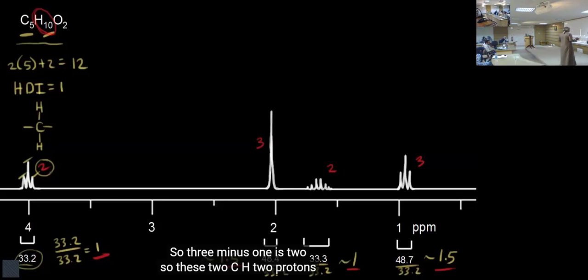Okay, I want to ask, I don't understand the sequence, whether this one is correct and whether this one is correct.